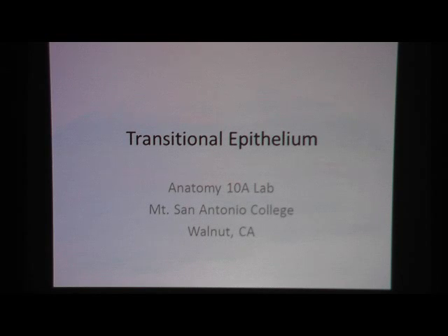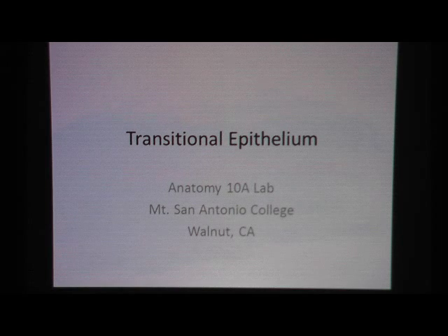Transitional Epithelium. These slides are made for Anatomy 10A lab at Mount San Antonio College.